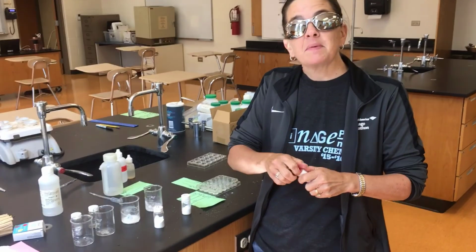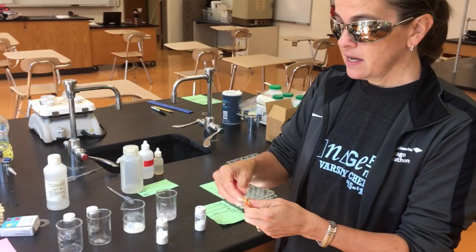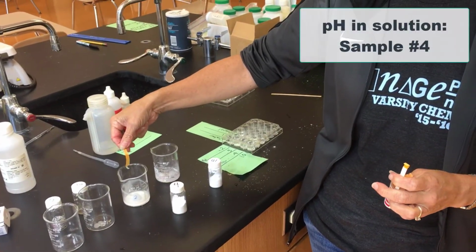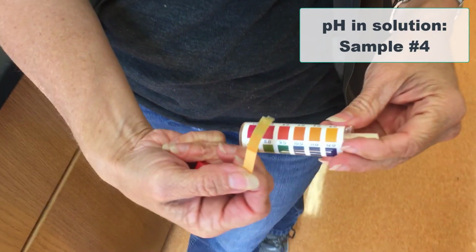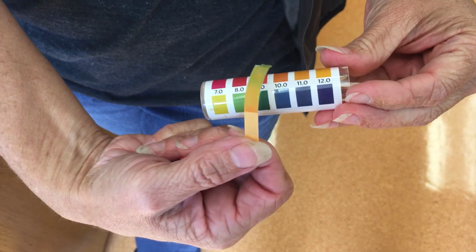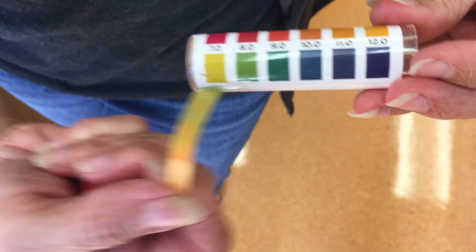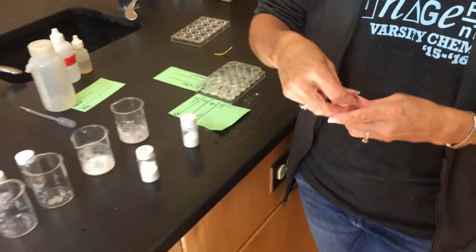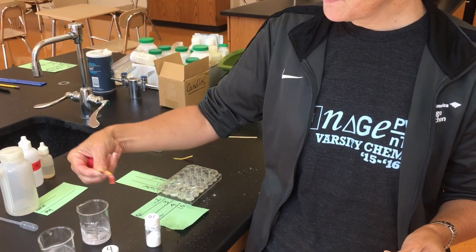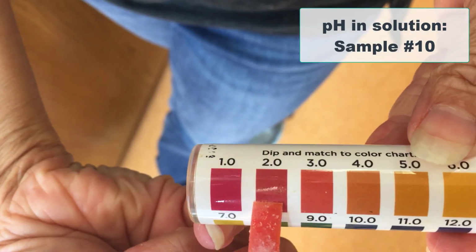Okay, and now we're going to test the pH of our 2 solutions. Remember, we're not testing our ones that we did not dissolve. And so my sample number 4. Well, that's interesting. I'd say it's maybe leaning even towards some green. Okay, and my sample number 10. Oh, and there we go. This time, oh, I'd say maybe even a 2.